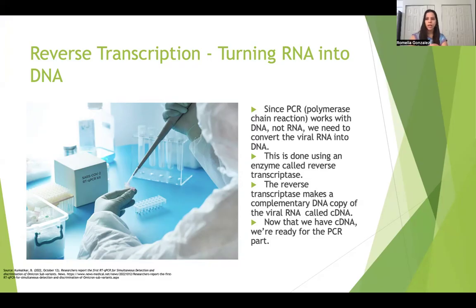This enzyme can be thought of as a molecular translator, since it will read the viral RNA and translate it into DNA. This new strand that we made is called complementary DNA or cDNA. This step is critical because it gives us a stable DNA version of the virus genetic code. Once we have the cDNA, we're ready to move on to the next step, which is the PCR.